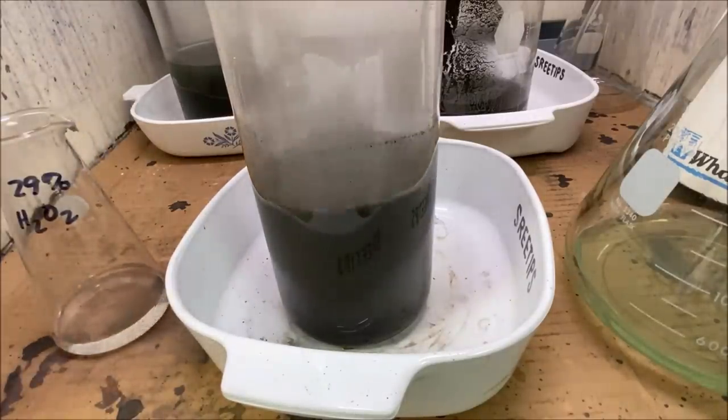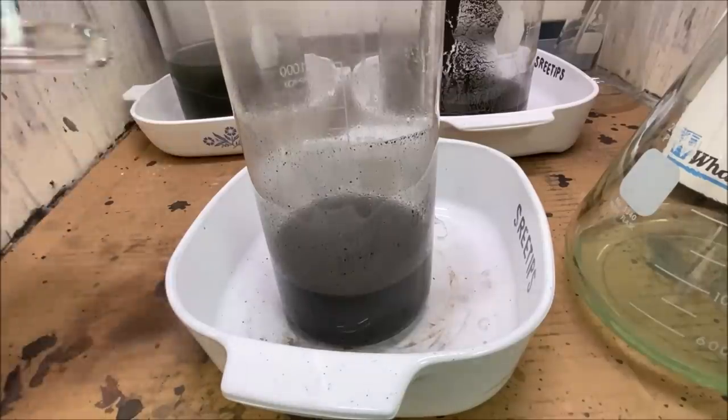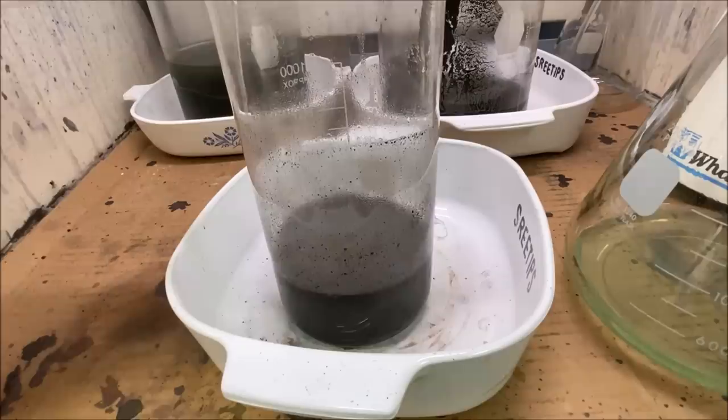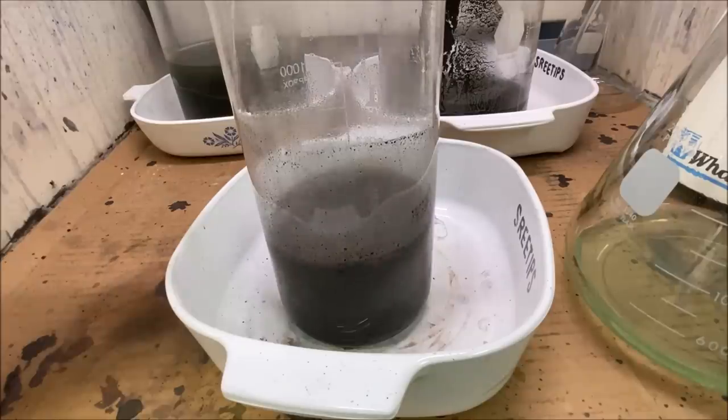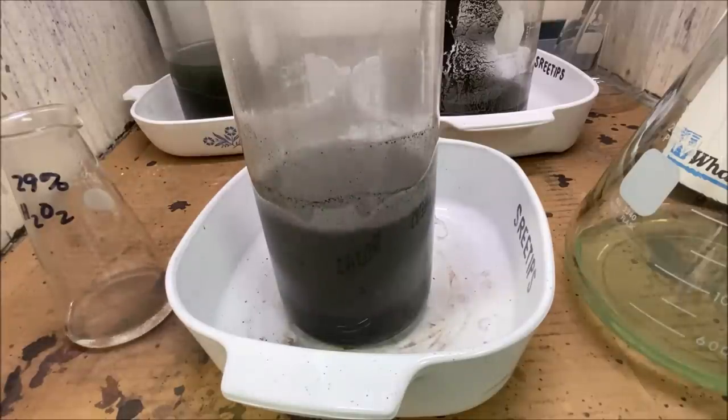Yeah, it's a fairly vigorous reaction, but I'm willing to go through this if we can get all our material pulled through that filter like that last group went through. No problem.